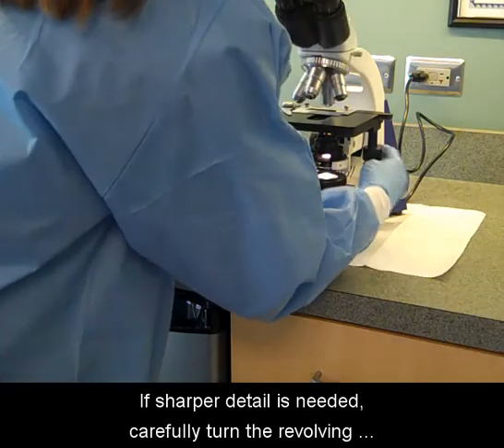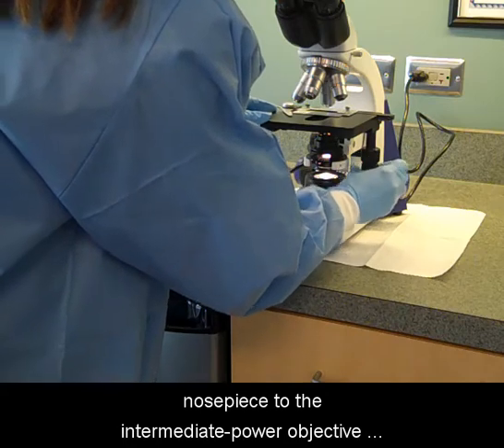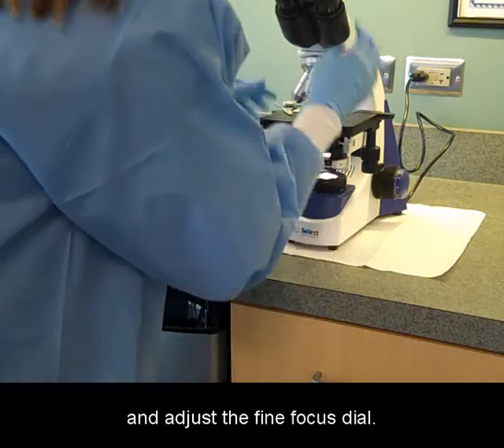If sharper detail is needed, carefully turn the revolving nose piece to the intermediate power objective and adjust the fine focus dial.